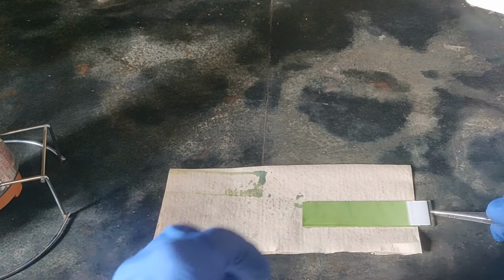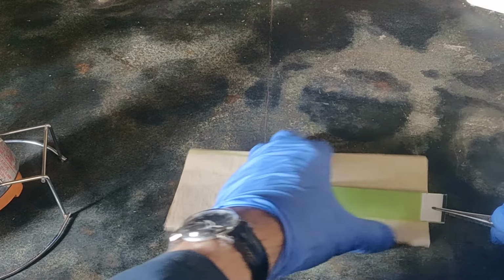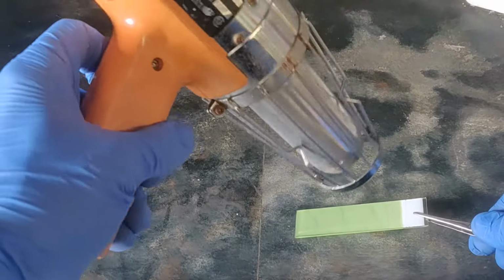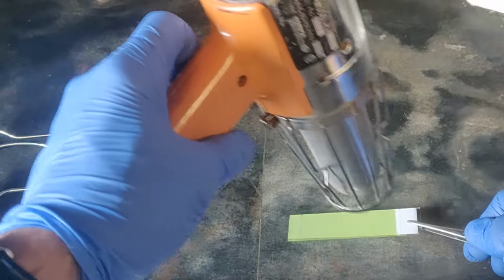Immediately heat the plate surface with the heat from a heat gun positioned about 2 to 3 inches from the surface. Keep heating until components on the plate appear as dark spots, and then stop heating after a further 10 seconds or so. Continued heating may make the spots fade.